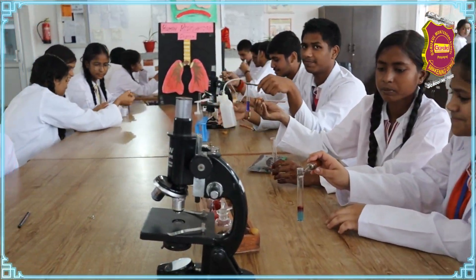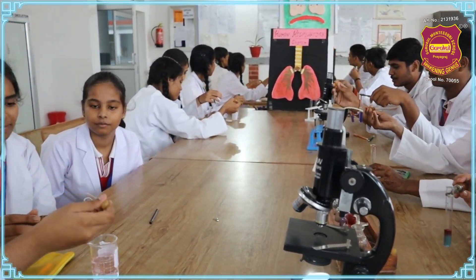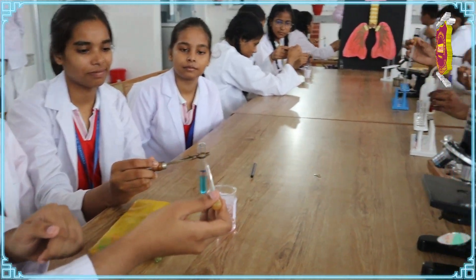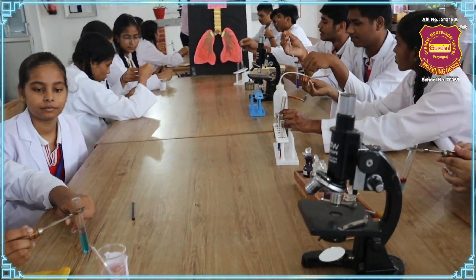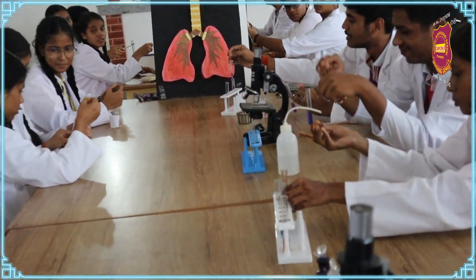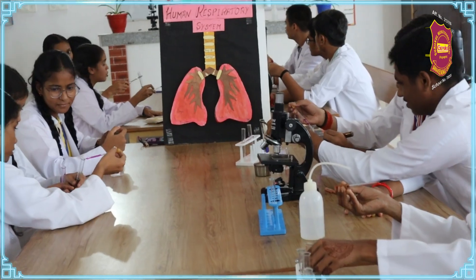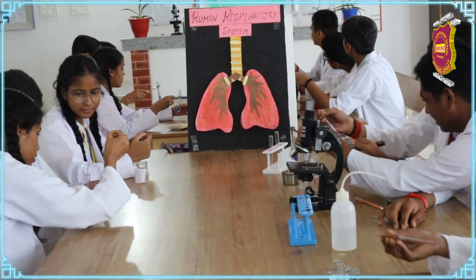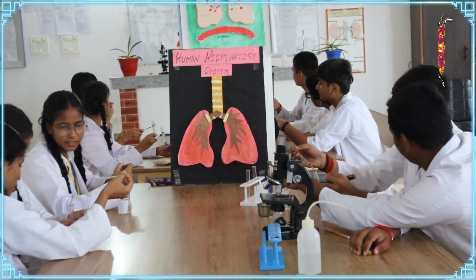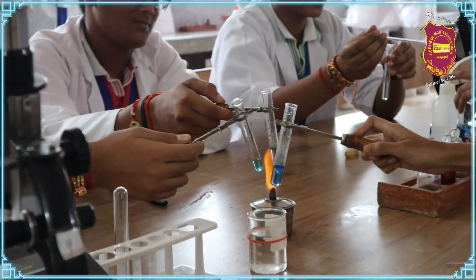I have obtained this kind of color, and now I will leave it to cool. This brick red color has been obtained, indicating a high concentration of sugar in the sample.